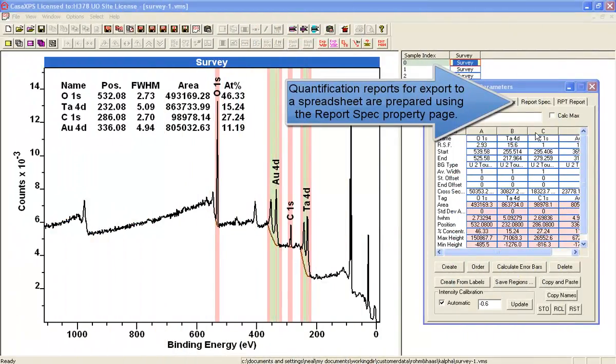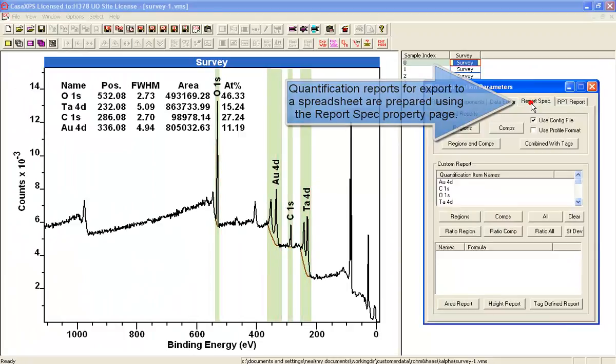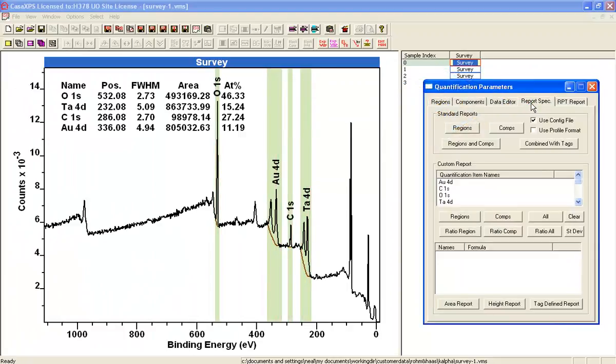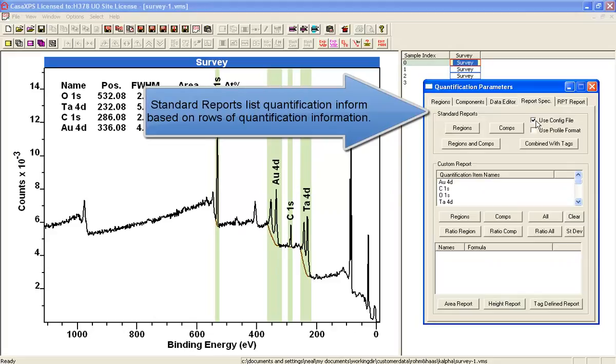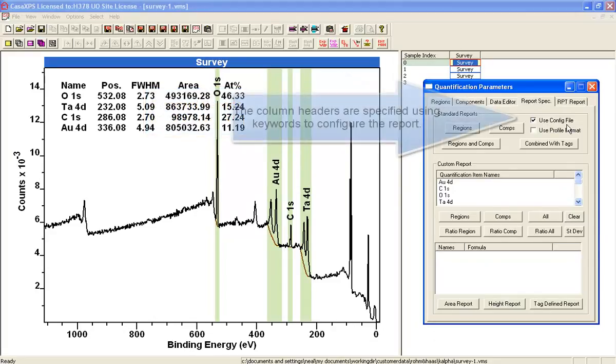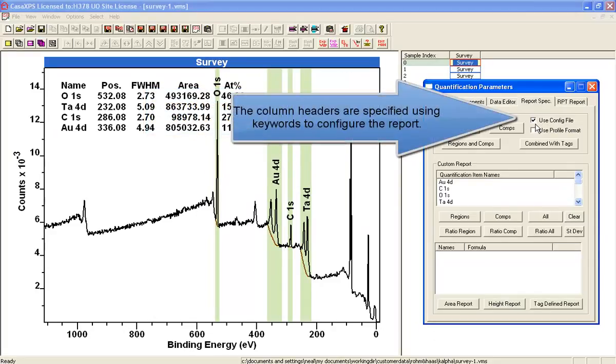Quantification tables generated from the ReportSpec page based on standard reports are determined by a configuration file when this box is ticked.